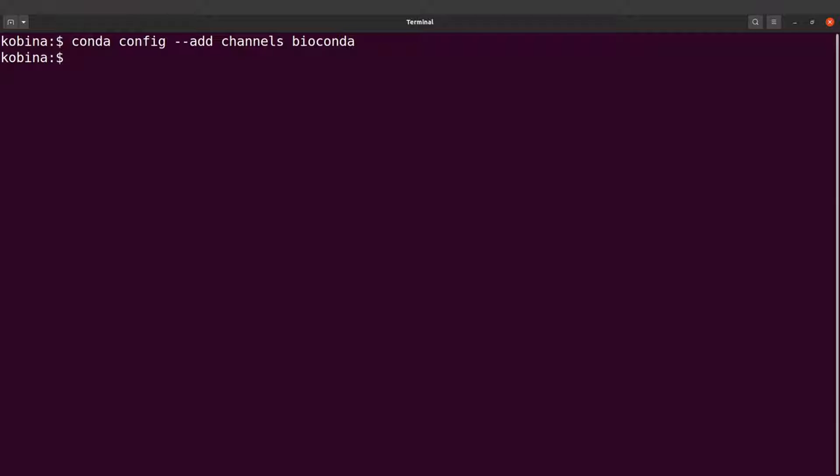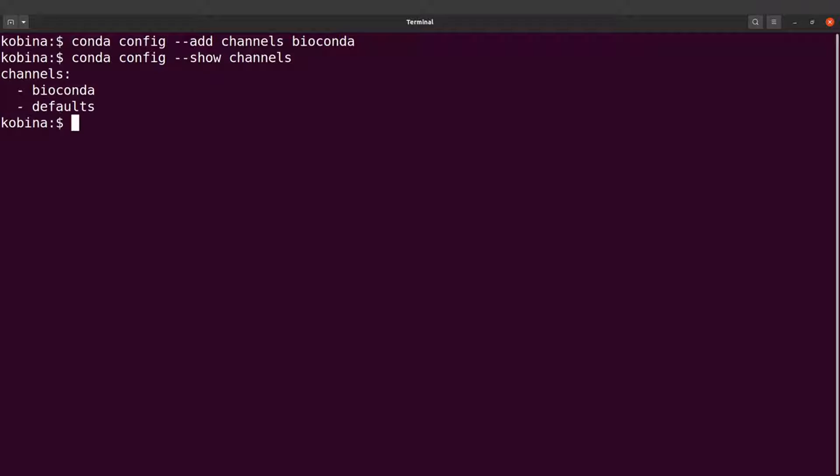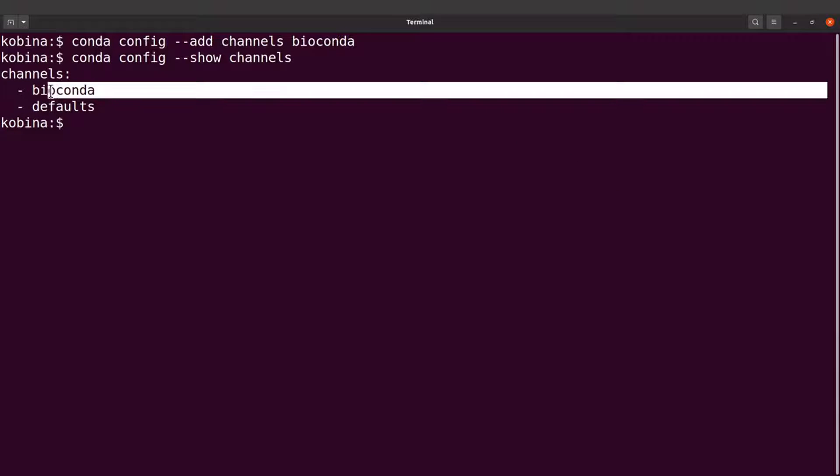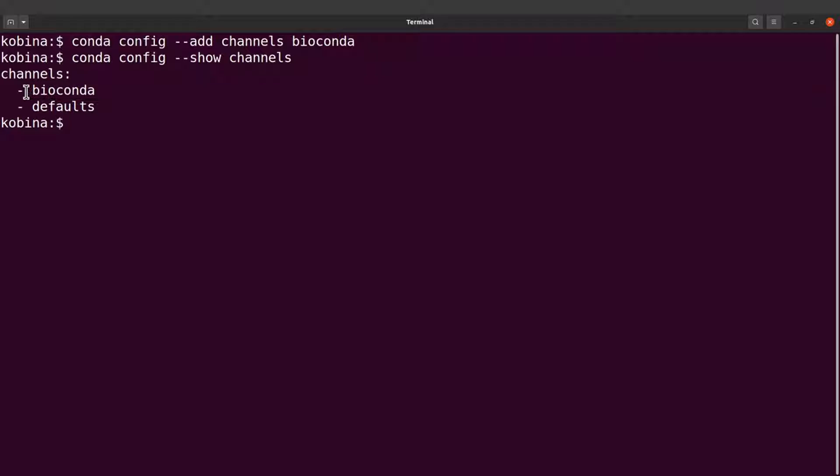The channel has been added. We can confirm. So we can say conda config show channels. This will list the channels we have on our system. We have bioconda which we just added, and there's the default channel which comes packaged with conda.